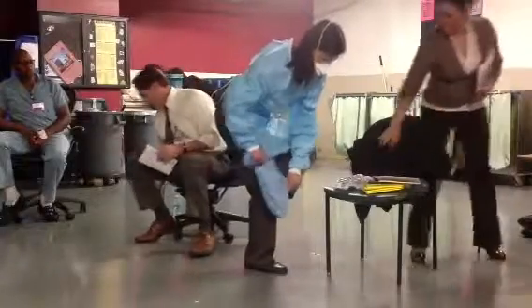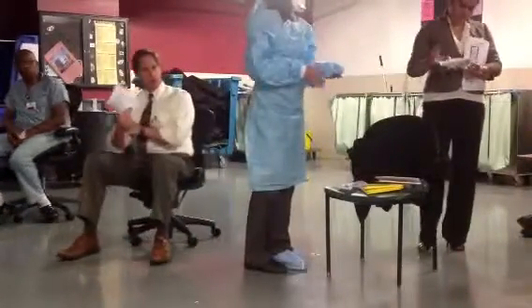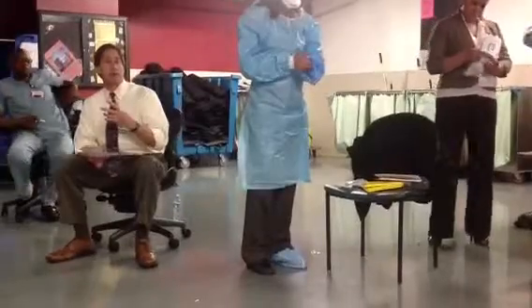A lot of these chemotherapeutic agents, they're liquid. You know, they're going in IV, they're going to the patient. They're liquid, but they also quickly dry. So even within 5 minutes after a spill, you can see that it's dried, but you usually see the residue, a dry white powder or something in the area where the spill was. When you do that, a lot of times you need extra water to rehydrate it so you can clean it up easier.